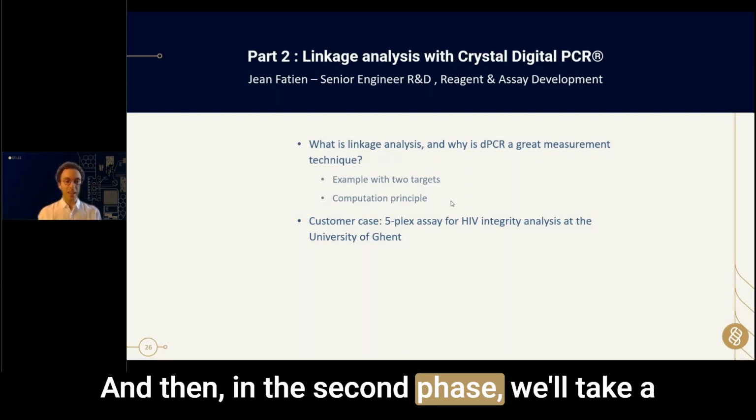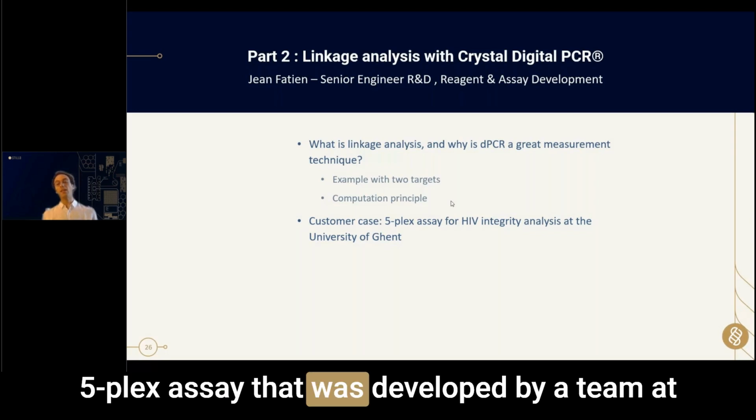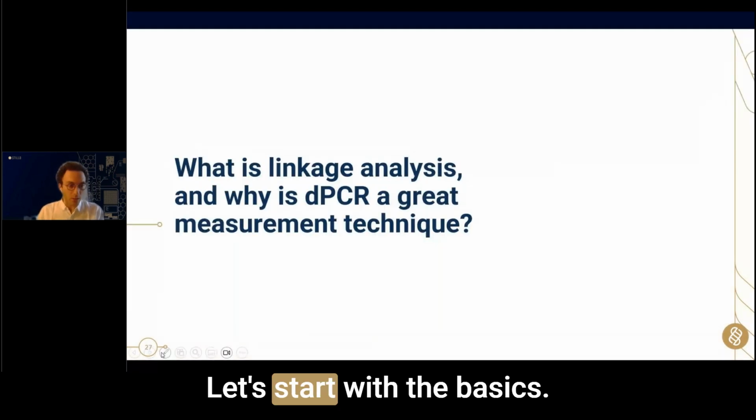And then, in the second phase, we'll take a customer case. We'll see the example of a 5-plex assay that was developed by a team at University of Ghent to evaluate HIV integrity. Let's start with the basics.